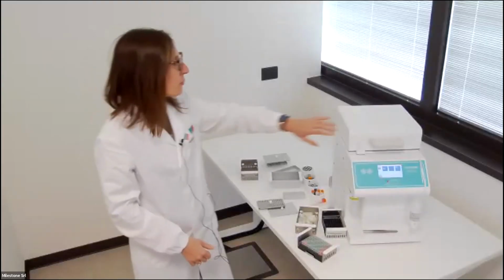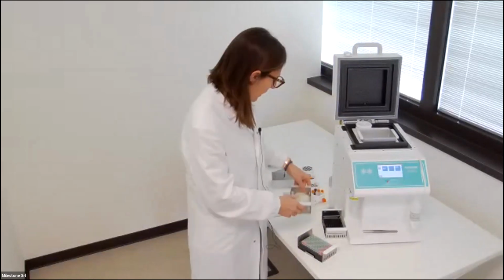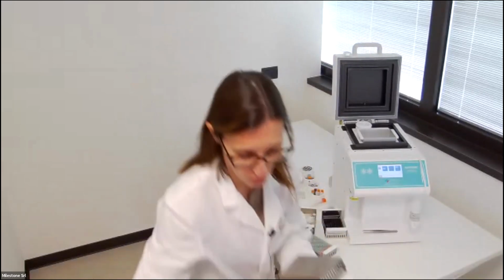How can I control the level of the reagent? Yes, that's an important point. In both the plate rack and the random rack, maybe I zoom in so it's better for you to see.